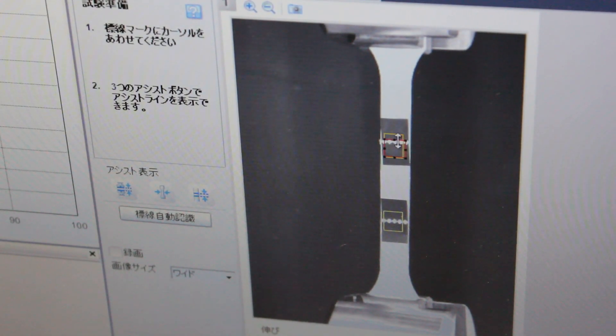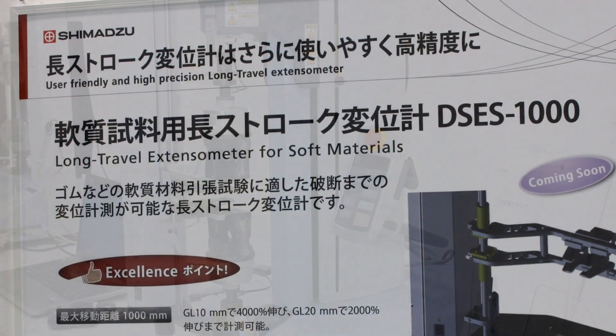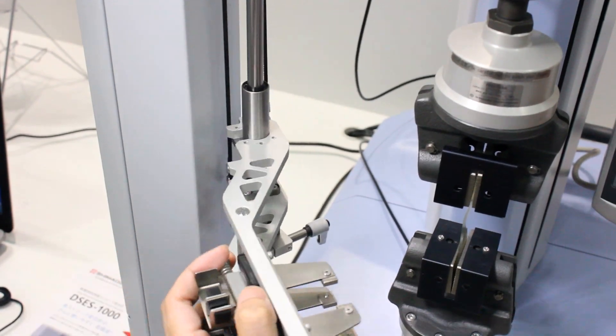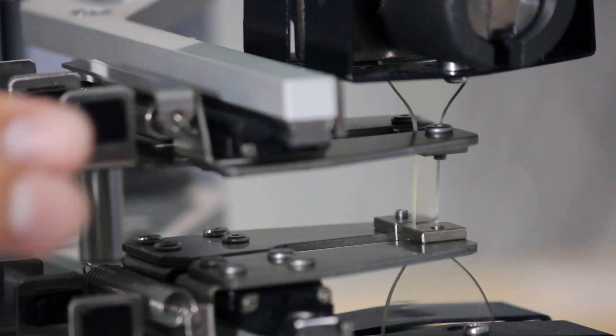This extensometer is fully controlled via the Trapezium X software. The DSES-1000 is the newest contact-type long-travel extensometer for soft materials, featuring a super easy clamping structure that dramatically improves test productivity.